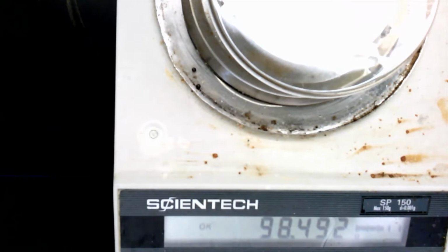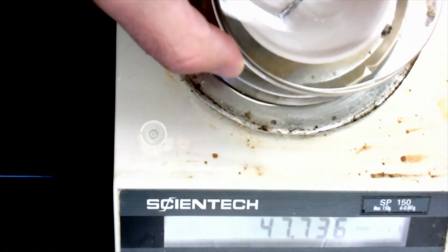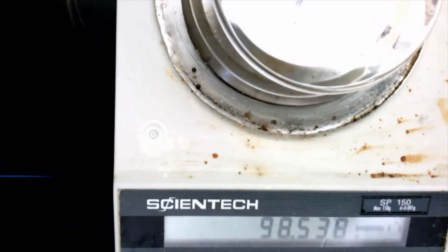Okay, my next step is to weigh this with my polished magnesium ribbon in it. So it should go up a little bit in mass. So make sure you record this number as well. Then it tells you to find the mass of the magnesium ribbon by difference.